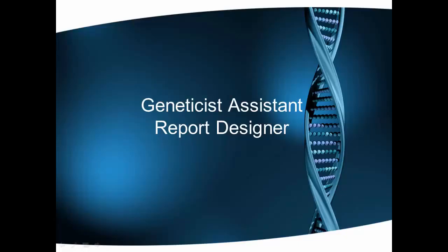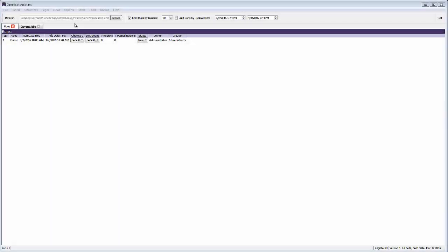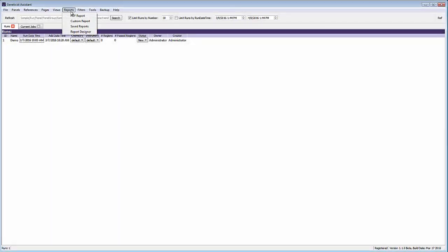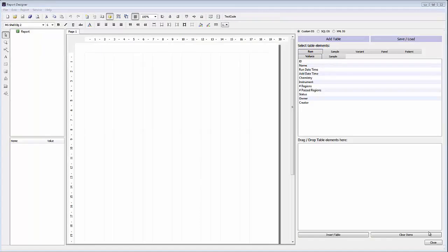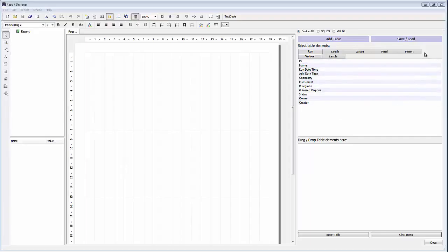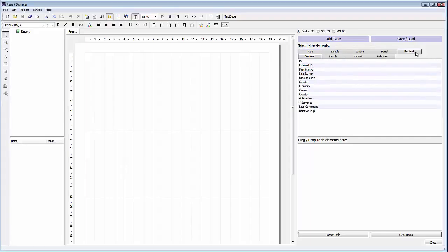This video demonstrates how to create a report template with Geneticist Assistant's report designer. The report designer can be accessed from the reports menu in Geneticist Assistant. When the report designer is first opened, near the top right you can see the different fields that are available from the Geneticist Assistant database to be included in the report template. In this example we'll be creating a patient-based report, so we'll be using the patient tab.